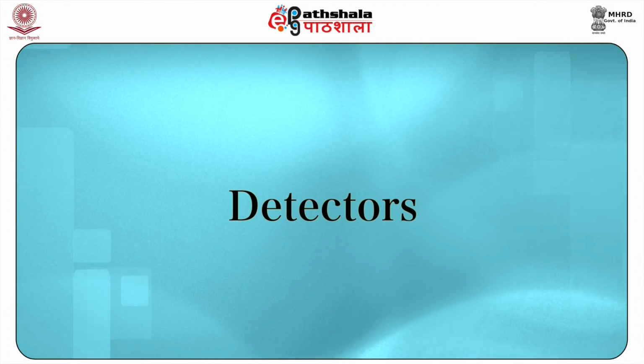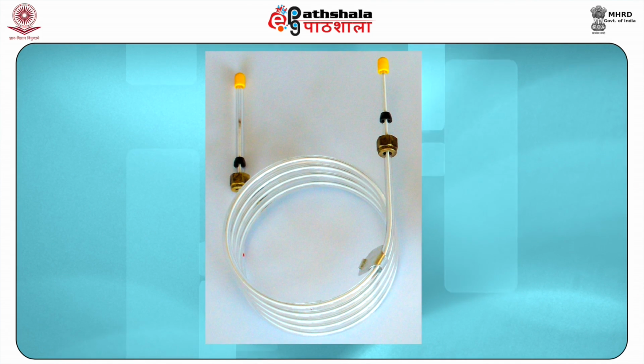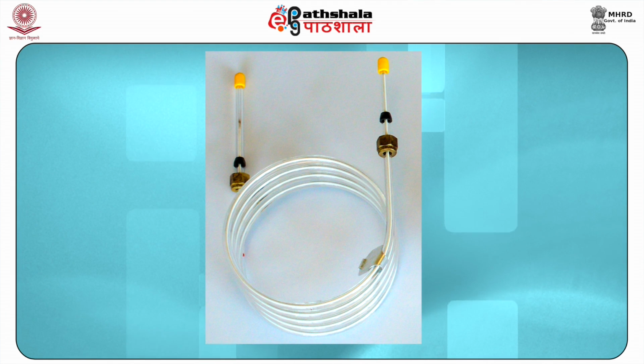Next is column temperature. For precise work, column temperature must be controlled within tenths of a degree. The boiling point of the sample determines the optimum column temperature. As a rule of thumb, a temperature slightly above the average boiling point of the sample results in an elution time of 2 to 30 minutes. Good resolution can be obtained by increasing the elution time while keeping the temperature at a minimum.